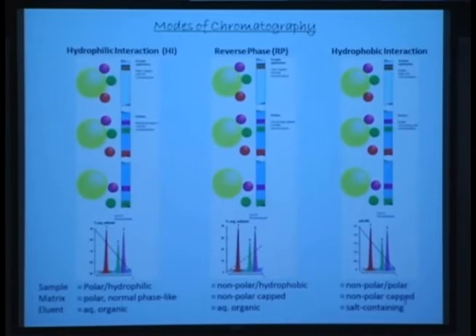And that technique is very useful, and these days gaining in usage, especially because reverse phase ion pairing coupled with mass spectrometry is a very powerful method to sequence sugars. And in one shot, you also get the structure. So it's very useful.